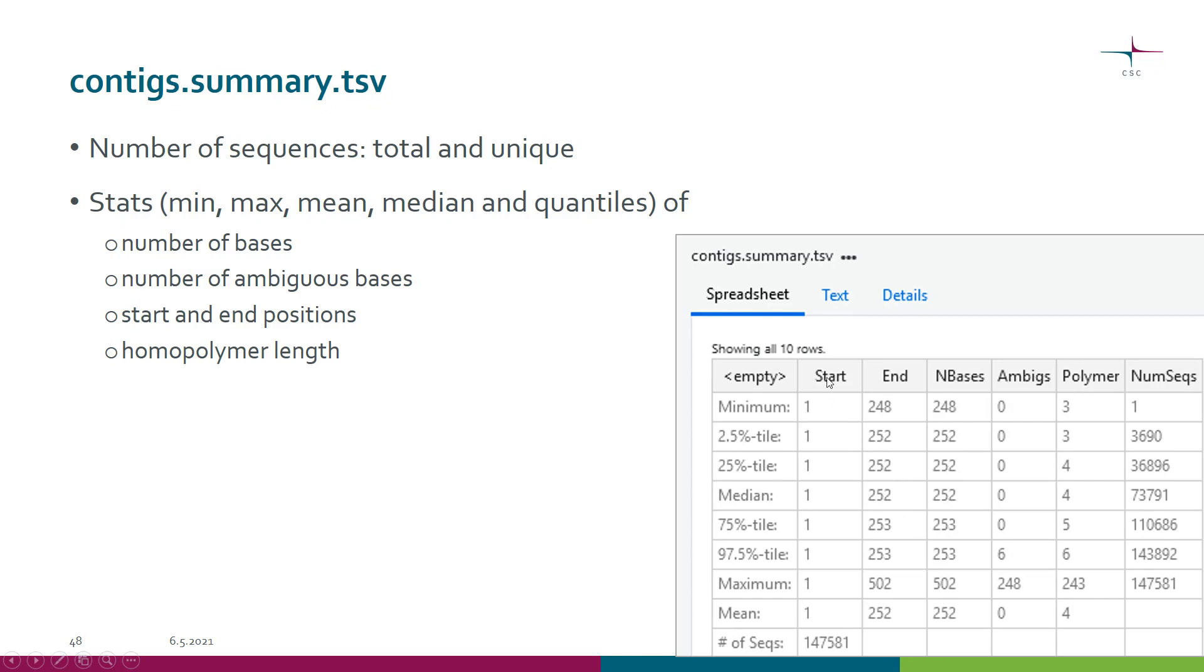We also have start and end positions. These are more meaningful when we look at the data after the alignment to the reference, because then we get the alignment positions here.